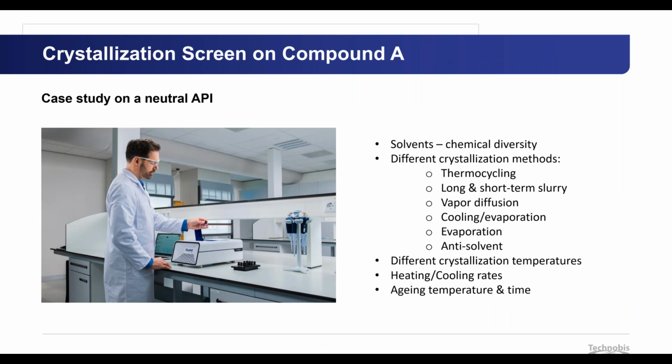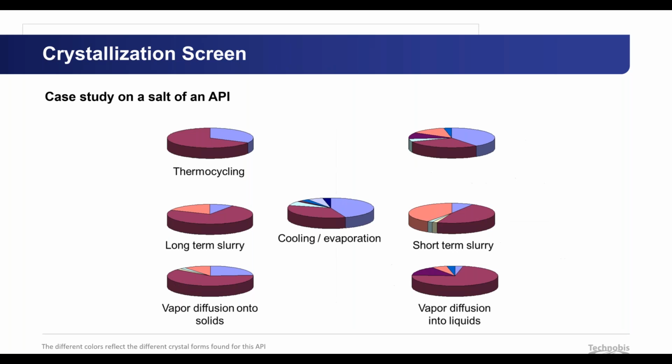Another idea on how to define your crystallization or polymorph screening, again, a few parameters that you can vary here, but this is related to multiple studies from quite a few years back, where we were looking at how to crystallize and get different polymorphic forms of different APIs.